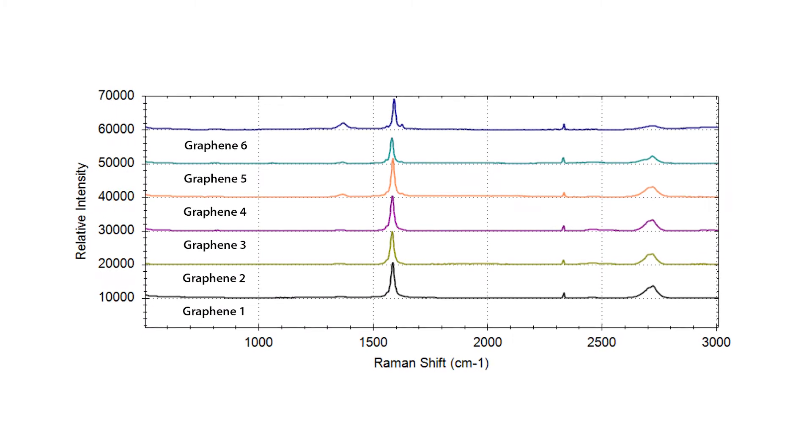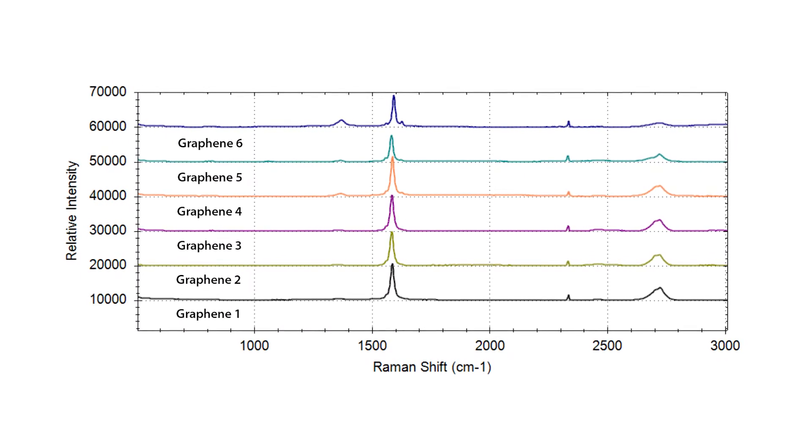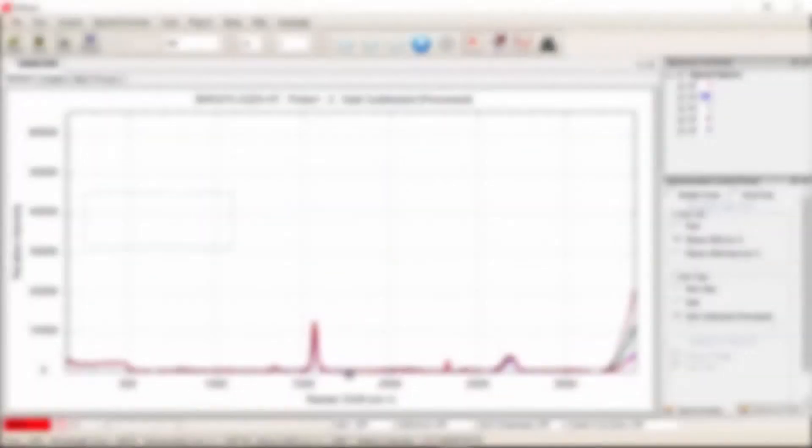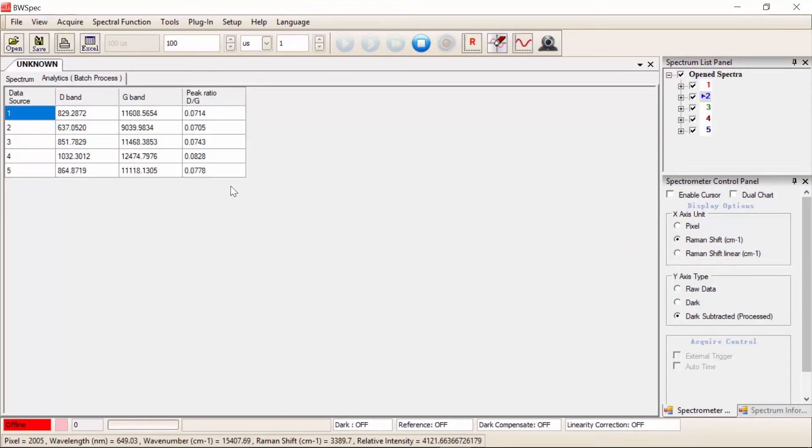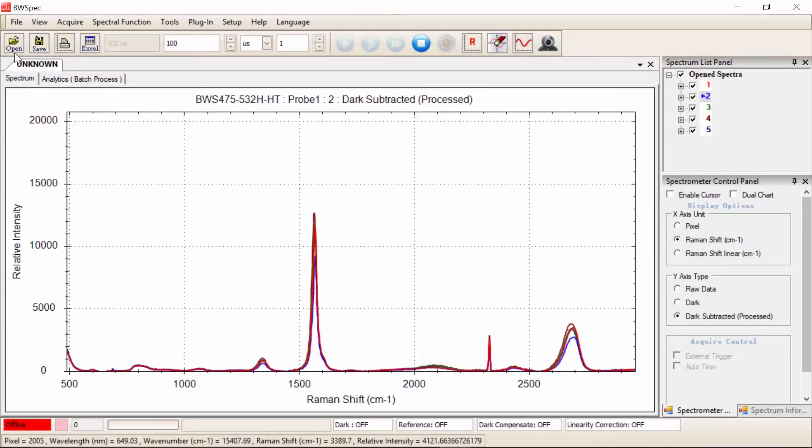BWSpec acquisition software can be used to monitor up to six Raman peak variables in real time and automatically calculate important peak parameters, such as the intensity ratio of the D-band and G-band, a powerful indicator of structural disorder within a carbon sample.